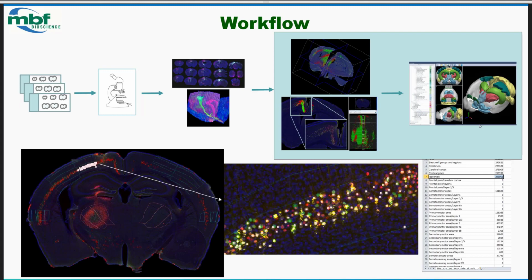That's the area we're going to focus on today, the highlighted blue square that I just put up there. In this example, once I've registered my images to the Allen CCF, any measures I make, and here, if you look, their actual cell coordinates in the experimental space, I can apply the transforms that register the images into the Allen CCF to the coordinates of the detected cell markers. And so then I can start to accumulate measures across animals in a common coordinate system. And Chip's going to kick off his part of things with a really cool case study that shows an endpoint and just the power you can have out of this particular technique.